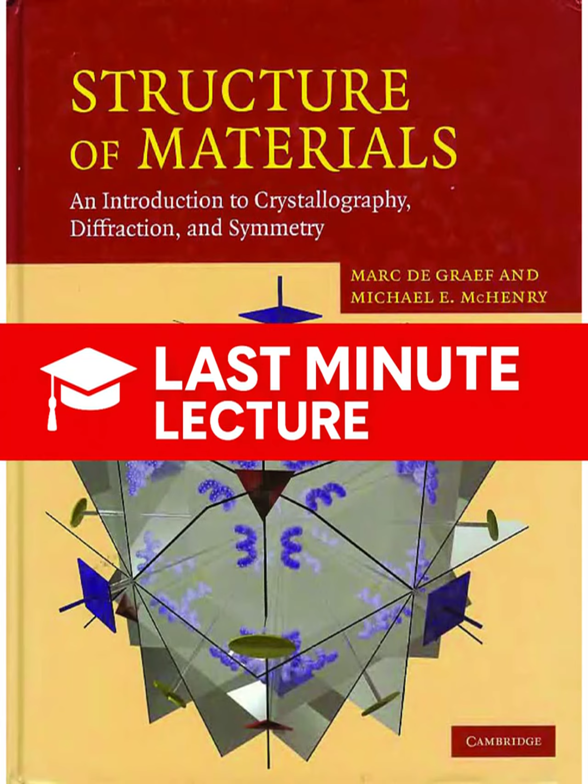It's a powder. A polycrystalline material, yes. A fine powder containing thousands, millions of tiny, randomly oriented crystallites or grains. And that randomness is the secret ingredient. It is. The Bragg condition requires a very specific orientation. If you had a single crystal, you would have to meticulously rotate it in 3 dimensions to find every single peak. With a powder, the random orientation guarantees that for every possible set of lattice planes, some fraction of the crystallites will always be oriented correctly to diffract at any given moment.